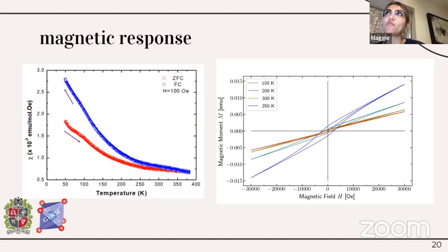Pueden mapear eso y pueden mapear también con otro tipo de punta la función trabajo. No sé si eso también les pueda ayudar a entender su material. Si no tienen por ahí, acá encima se tienen esas técnicas en el equipo de AFM. Es mi único comentario. Muchas felicidades.